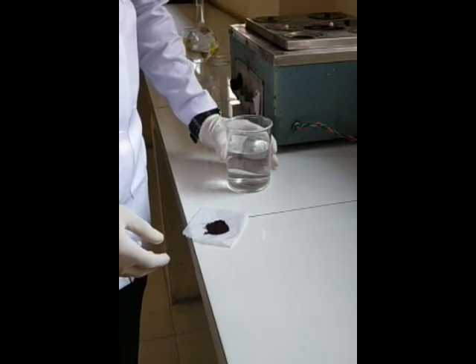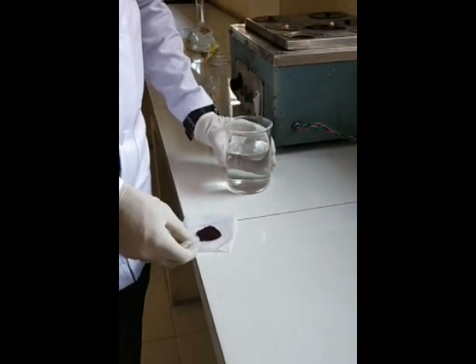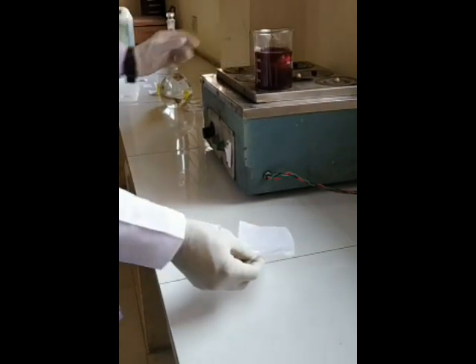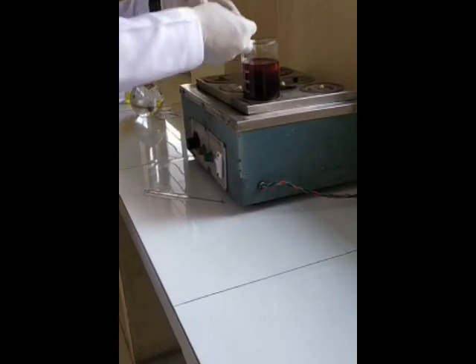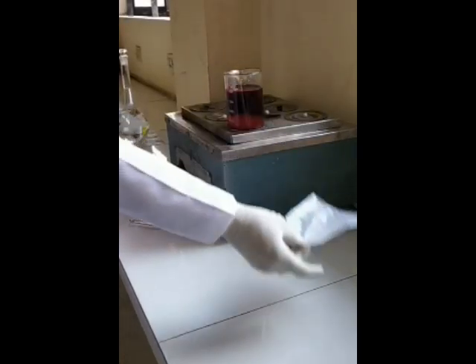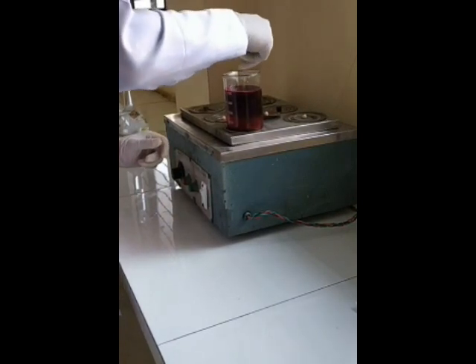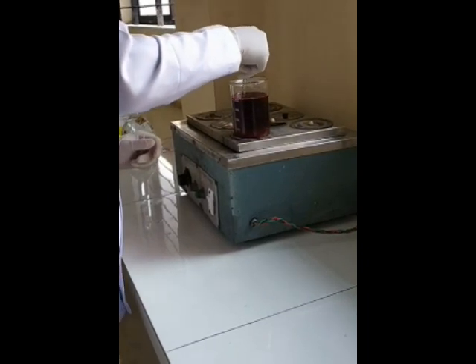Third step: preparation of colored syrup. Boil cochineal with 375 ml of purified water for 15 minutes on a water bath. After 15 minutes of boiling, add 700 grams of sugar to the cochineal solution with continuous stirring and boiling to make a colored syrup. Again, the solution is boiled for up to 15 minutes.